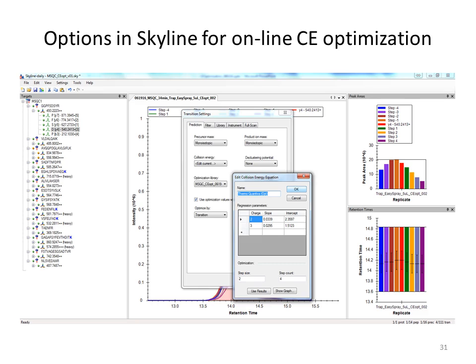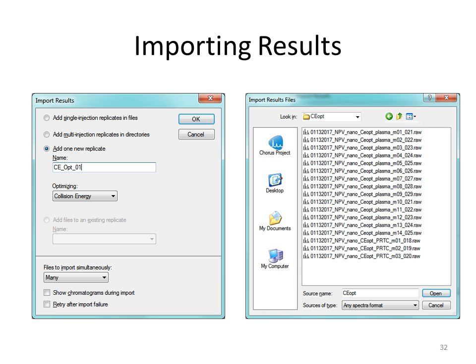A collision energy, and then plot the data. And you can see based on this, 2 volts less than what is predicted is probably best for this peptide, but it's not off by that much. And I have Skyline files in here with data that we can walk through showing how to do this.